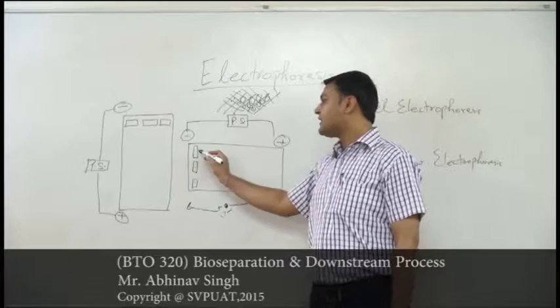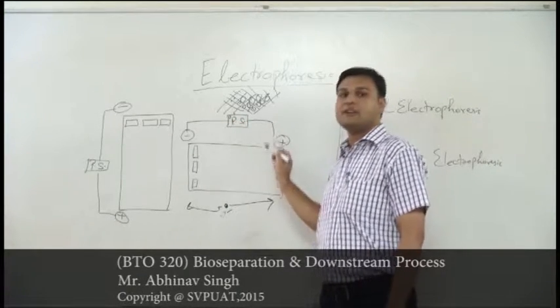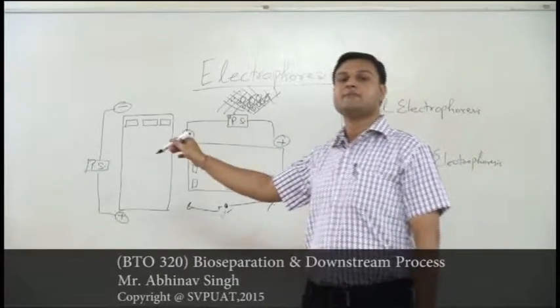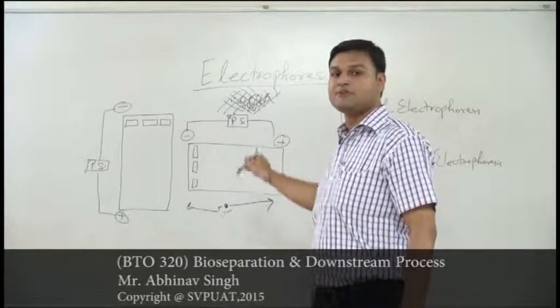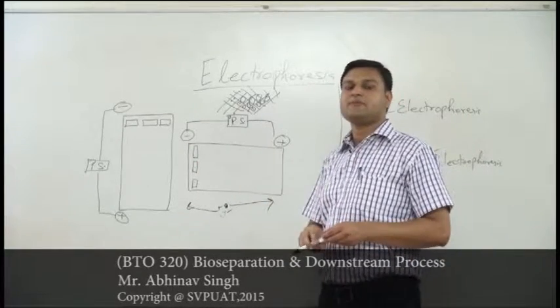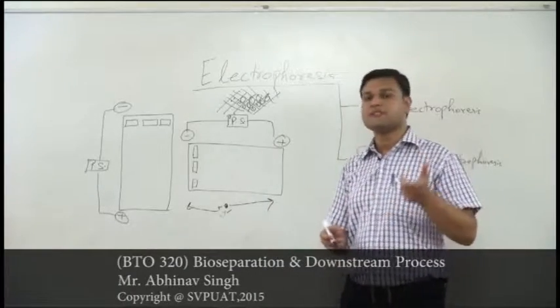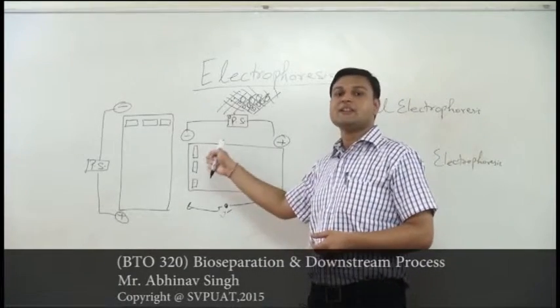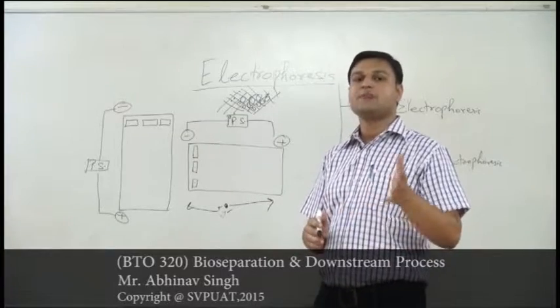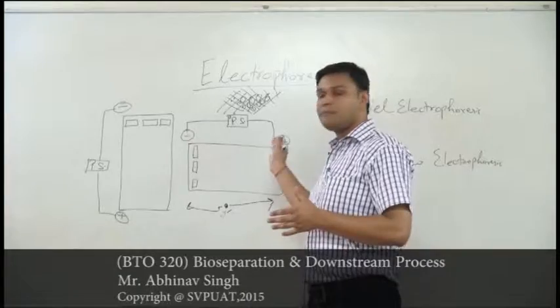After this, we are directly going to switch on the power supply. This power supply will activate the two terminals, that is, we will have a negative terminal and a positive terminal. Either in the protein case or in the nucleic acid case, in both cases, for best results, the casting of the gel is done towards the negative terminal, so that the majority of the particles move towards the positive terminal.